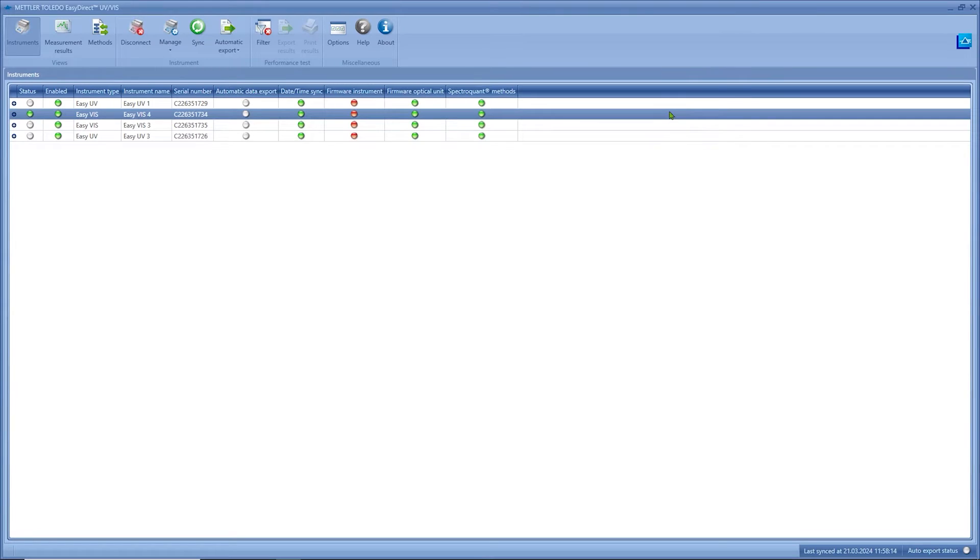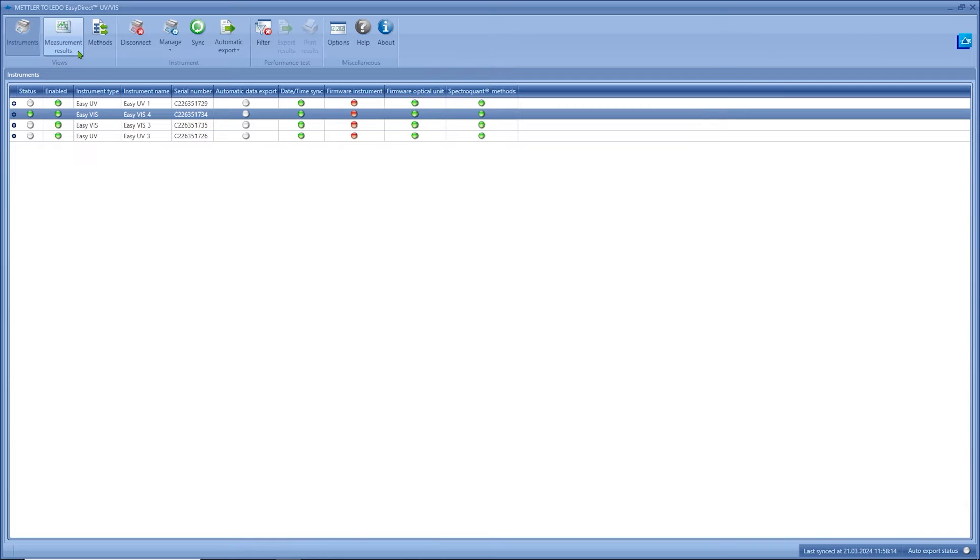Let's start with a quick introduction to the EZ Direct UV-VIS software itself. We have three main views: instruments, measurement results, and methods.